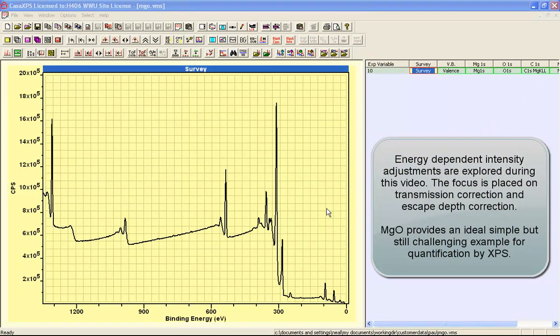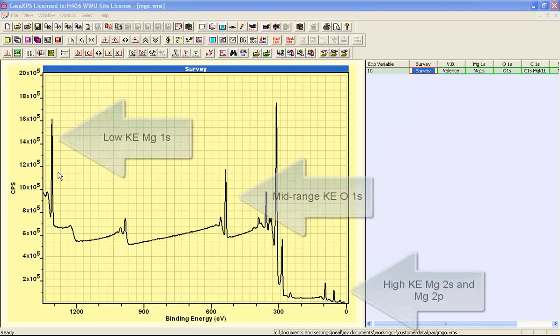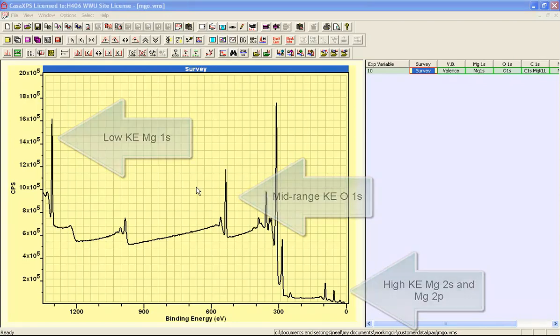This video is going to look at different aspects of quantification by XPS using an example of magnesium oxide. The reason that magnesium oxide is a good example for quantification of XPS is the stoichiometry is very simple between magnesium and oxygen.